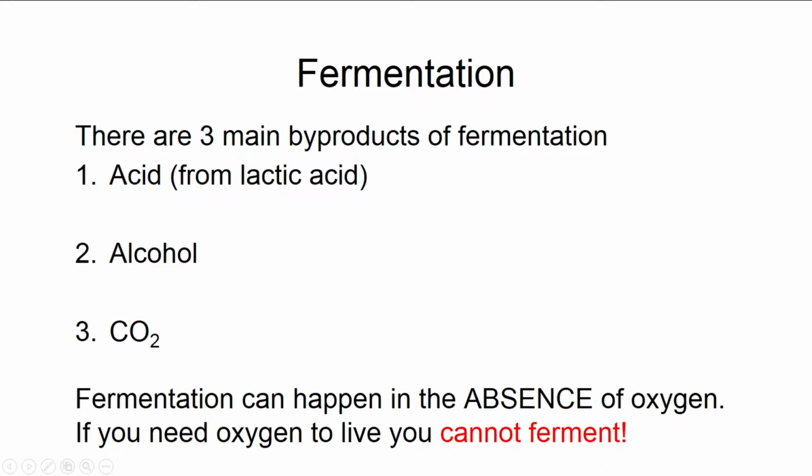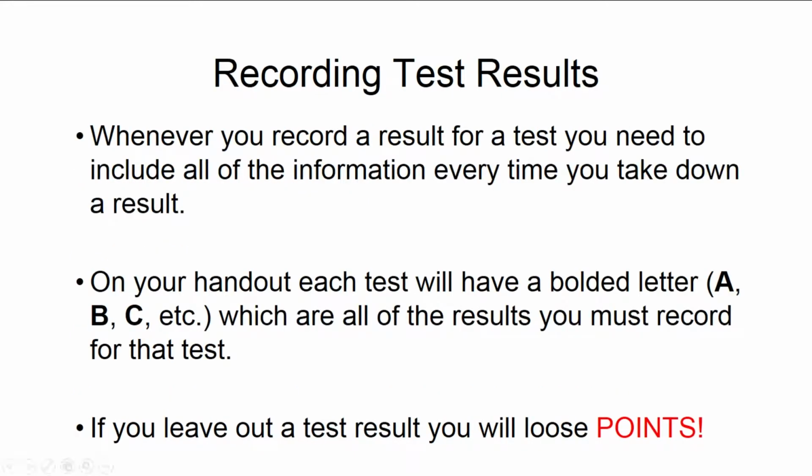Fermentation can happen in the absence of oxygen, so that's important to remember. So if you're an oxygen organism, if you're oxidative, you cannot ferment because you cannot survive without oxygen, so that just doesn't happen for you.